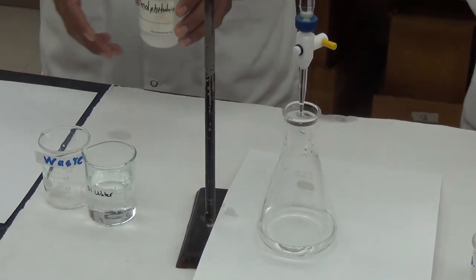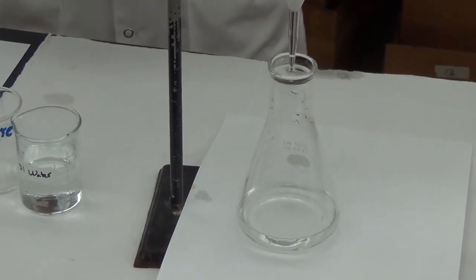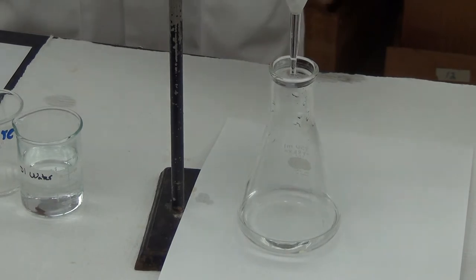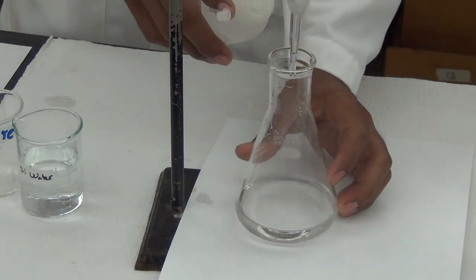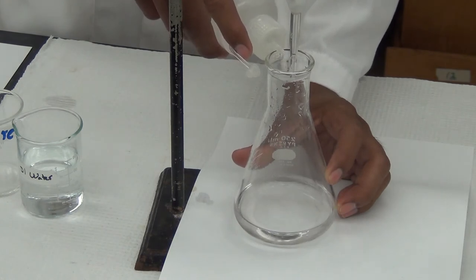As an example, we'll perform a simple titration. In the flask, we have 50 milliliters of vinegar to which we've added a few drops of phenolphthalein. This is the analyte. In the burette is our titrant, a standardized solution of sodium hydroxide.